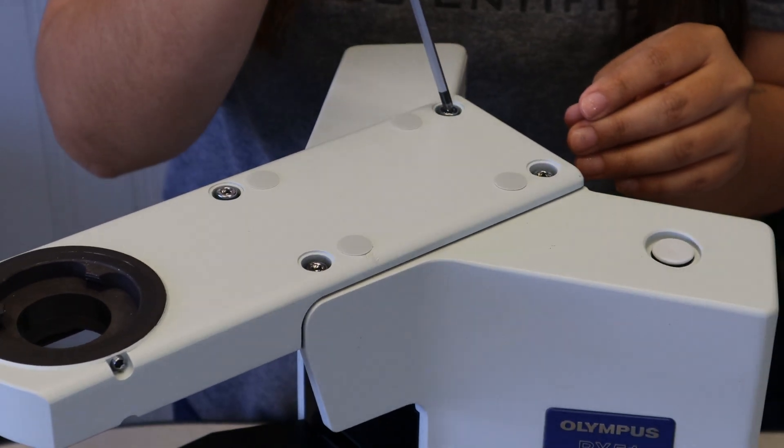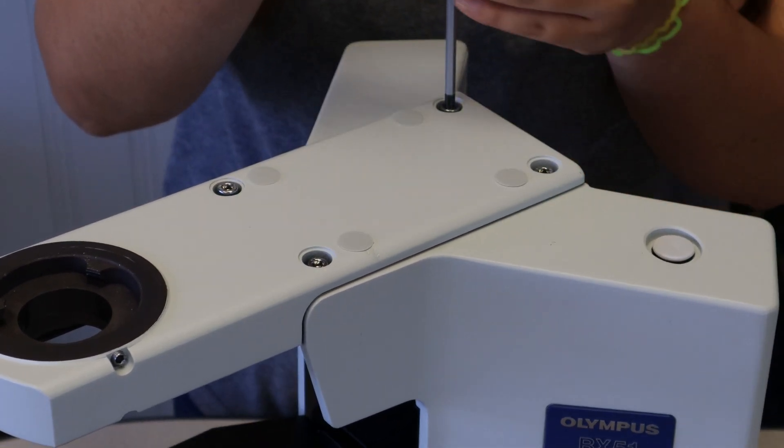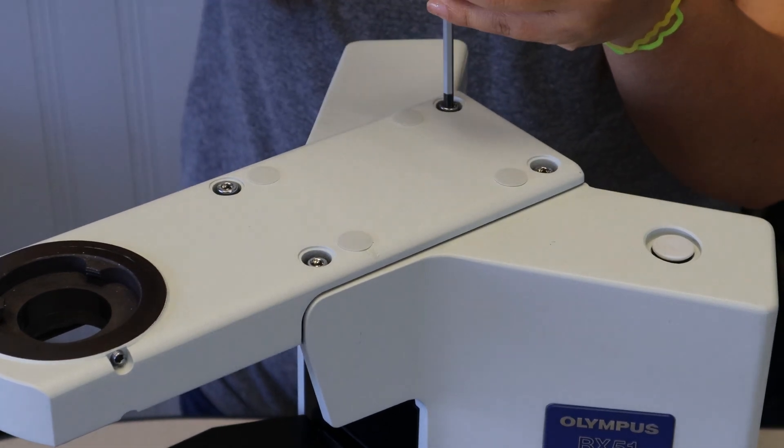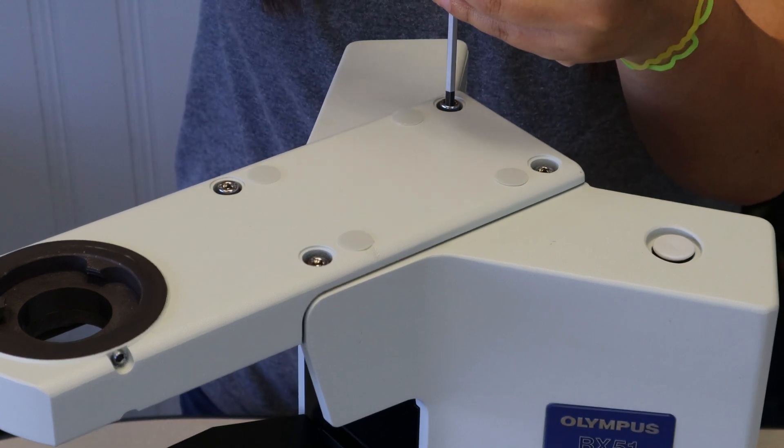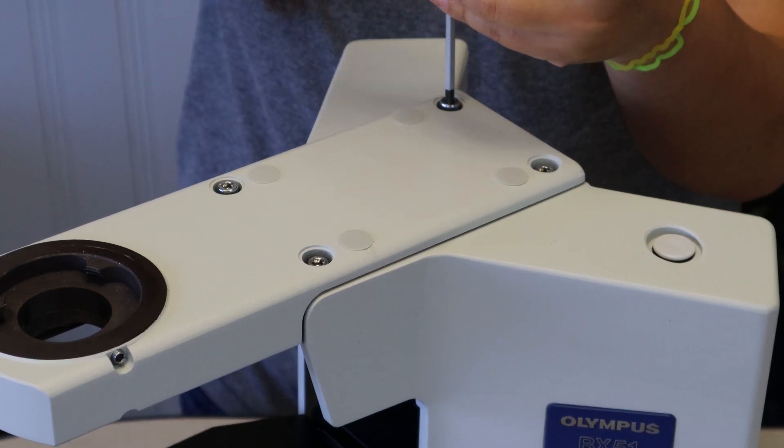Now you're going to grab your wrench, again this is the 4mm wrench, and you're going to start loosening up the bolts. We're going to have Maria do that real quick and we'll cut back when she's ready to take out the last one.